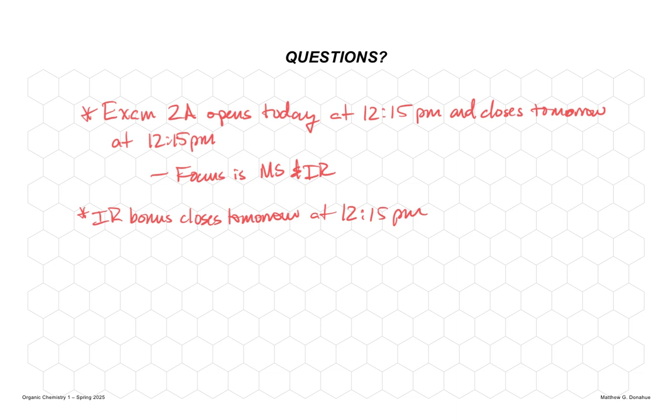And so today we're going to start on infrared spectroscopy. I'm going to give you the basics, a little bit of the theory, and how you interpret the spectra. There's two resources in Canvas that you should go through. One of them is a static PowerPoint. You can just click through. It shows you what the functional groups look like.